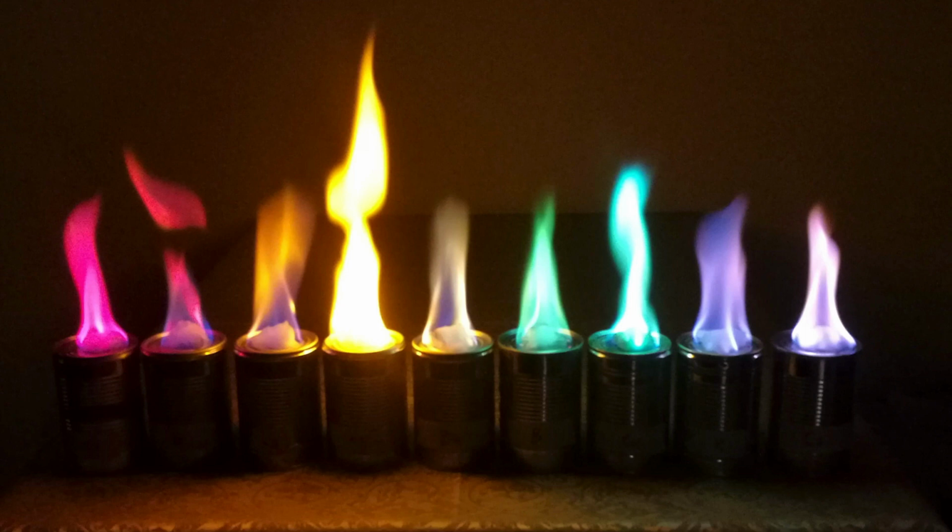The flame test is fast and easy to perform and does not require any equipment not usually found in a chemistry laboratory. However, the range of detected elements is small, and the test relies on the subjective experience of the experimenter rather than any objective measurements. The test has difficulty detecting small concentrations of some elements, while too strong a result may be produced for certain others, which tends to drown out weaker signals.